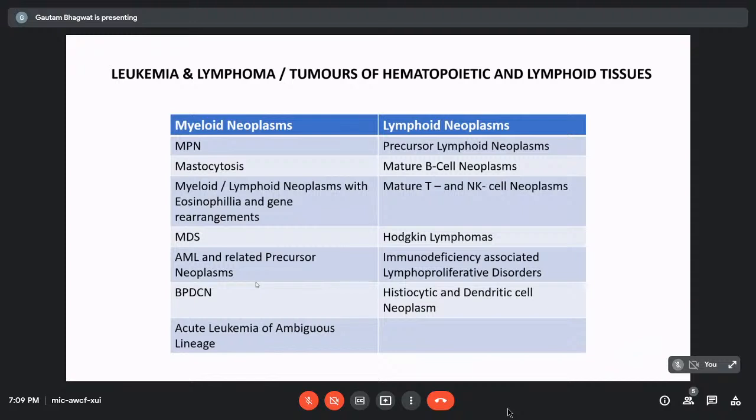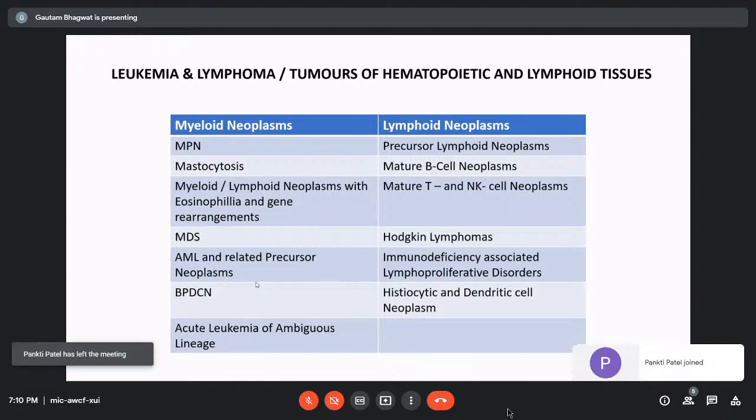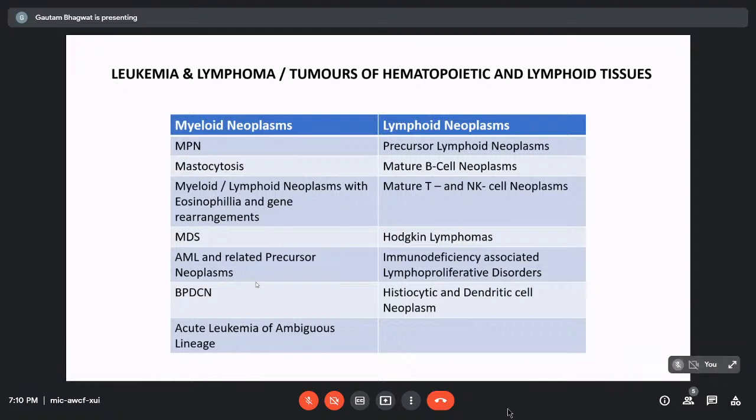Or, for example, in an MPN or an MDS, a combination of clinical symptoms, morphology, and molecular and cytogenetic analysis would give us the diagnosis. Flow cytometry would help in all these diseases, but usually we don't receive samples for all the entities. I would be going through the routine specimens that we get, that is, the diagnosis of the entities for which we get samples, in this talk.